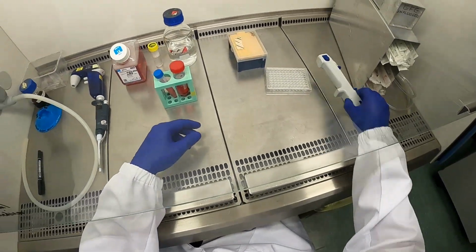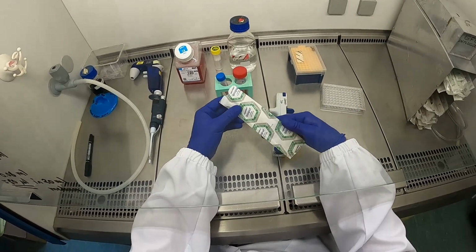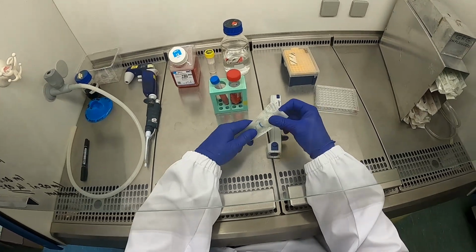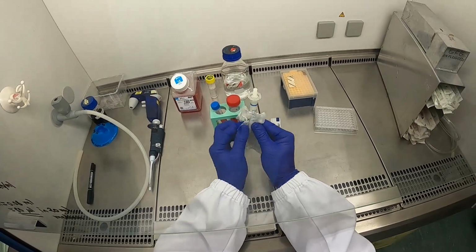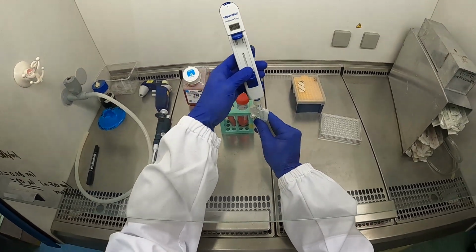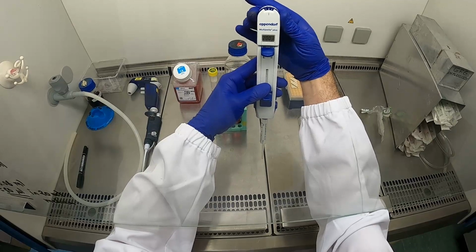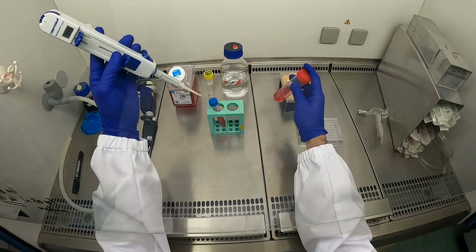Okay, now let's have a look at this funny thing. It's also a pipette, but it's a repeating pipette, and it uses this tip, which is called a combi tip, and the volume of that is 5 ml, and it also says 1 means 100 microliters, setting 1. So it's sterile, so carefully peel it out of its package, insert it into the repeating pipette, and then set the dial to 2, because 2 times 100 microliters should give you a pipetting volume of 200 microliters, and the display will indicate that as well.